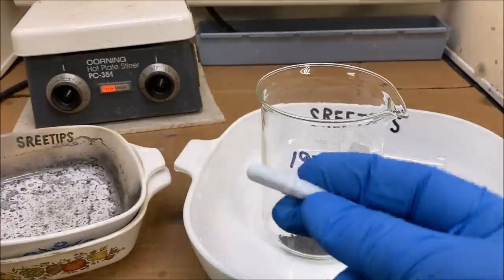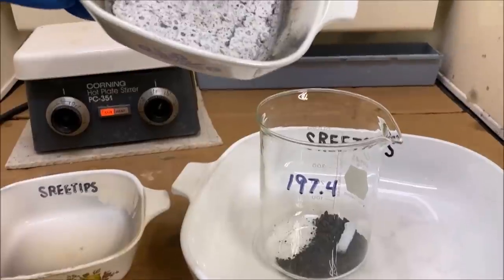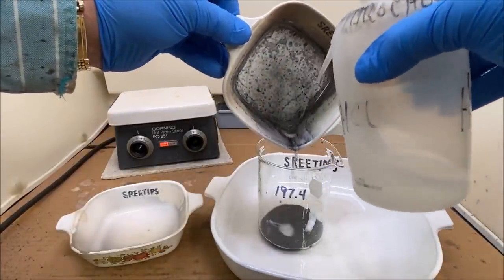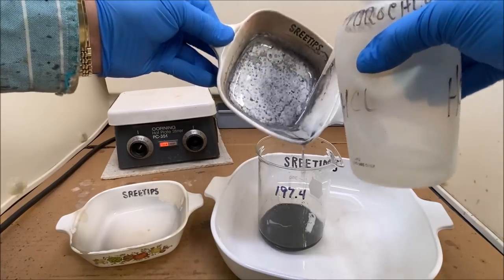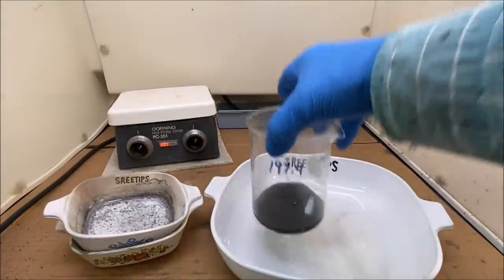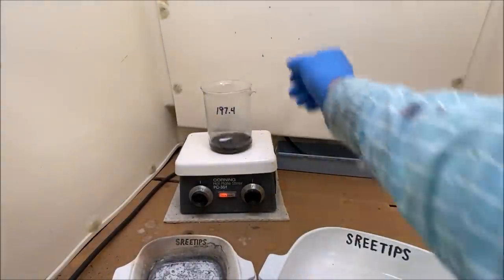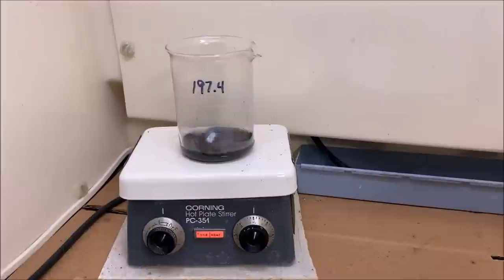Got a stir bar here. And what we're going to do is rinse this out a little bit with some hydrochloric acid, get any remaining stuff in here. Not much, but just a little bit, down into the beaker. We'll put this up on some heat back here. Just give it a quick boil in hydrochloric acid. See what that does for us.